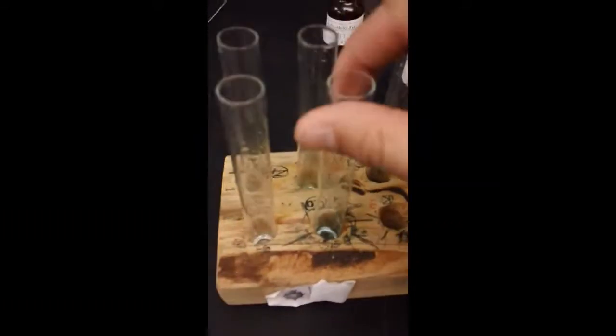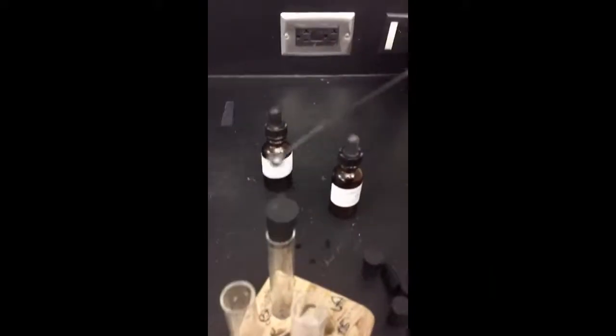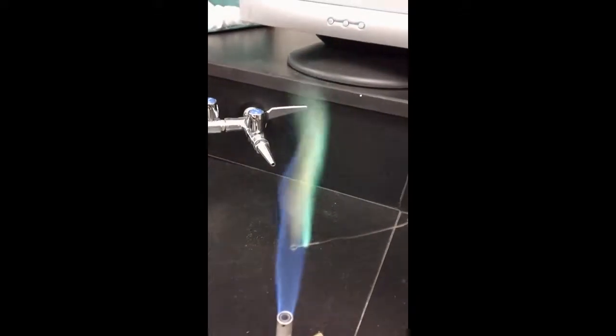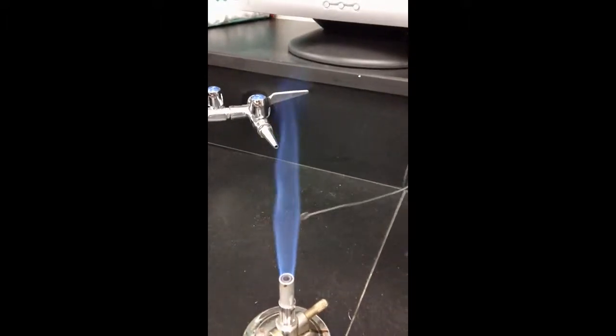Now what we're going to do is switch to our other side, and we're going to be doing CU next. So here you can see CU. Okay, put it down in there. Make sure I have my loop. Oh, nice and obvious there. Do you see that? Full green. Okay, I'm going to do it one more time.